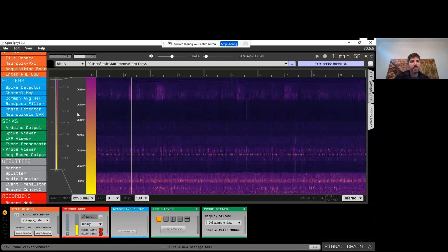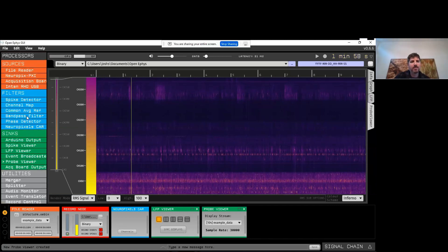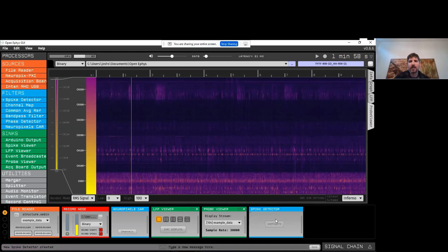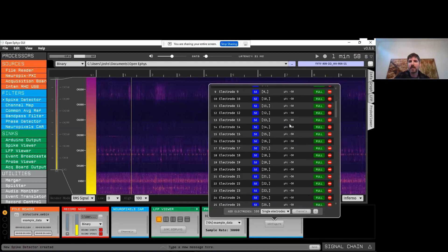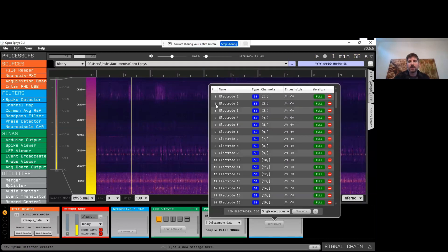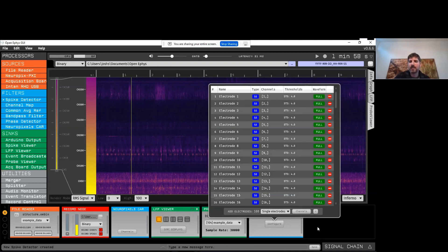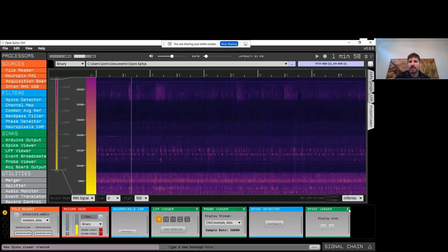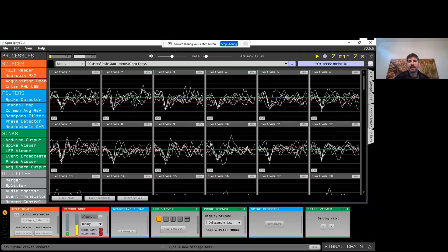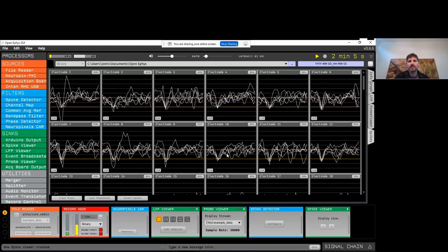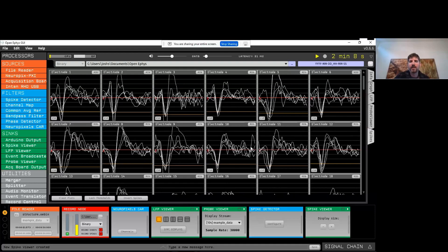I also want to quickly demonstrate the ability to detect spikes in the data. There's a spike detector plugin that you can configure with any number of electrodes. Let's add electrodes for the first 100 channels of our Neuropixels probe. You can Control-A to select all of them and then change things like the thresholding method — for example, set an automated threshold based on the standard deviation of the signals. Then just add a spike viewer, and you can visualize the spike waveforms detected across all these sites. The thresholds will update and you'll be able to see the automatic thresholds for all of these channels.